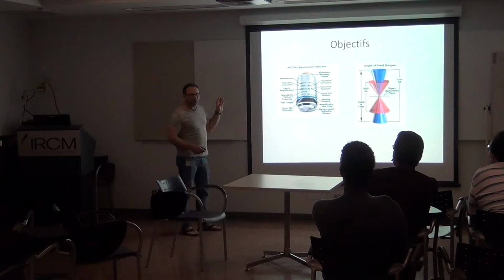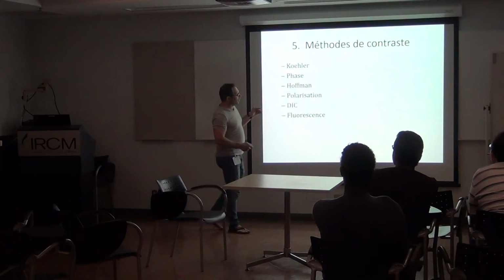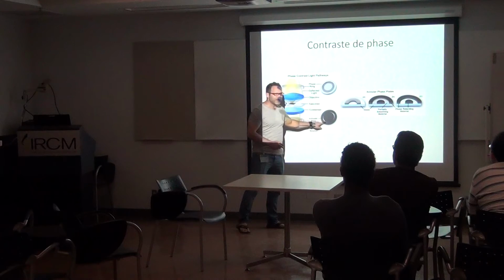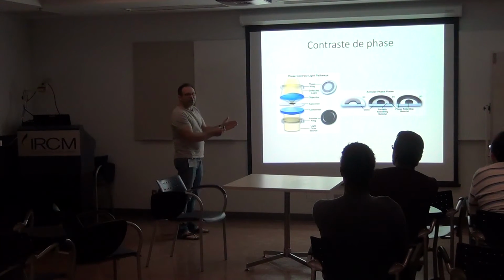Usually it's going to be written pH 1, pH 2, or pH 3. The 1, 2, and 3 is about the size of the ring. A smaller ring will be pH 1, pH 2 is going to be a bigger ring, and pH 3 is going to be a much bigger ring again.